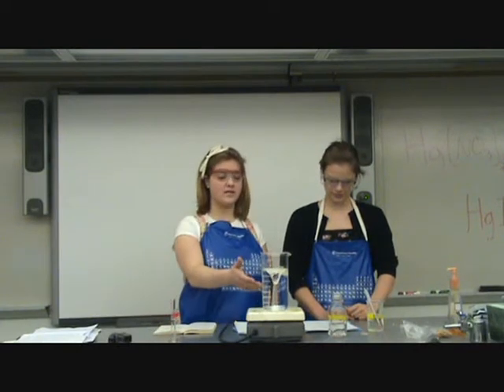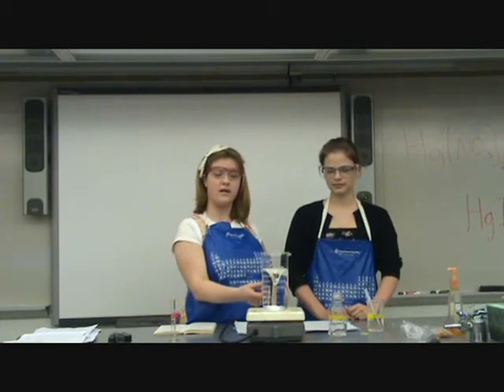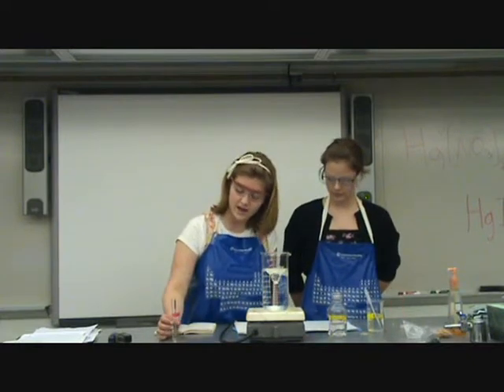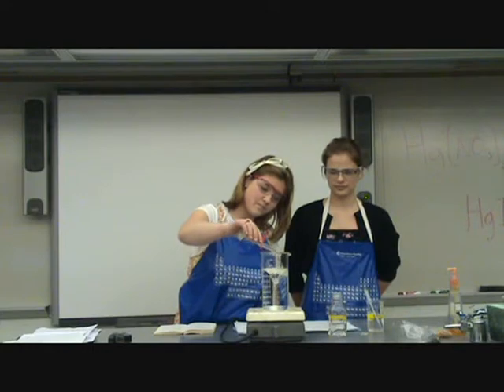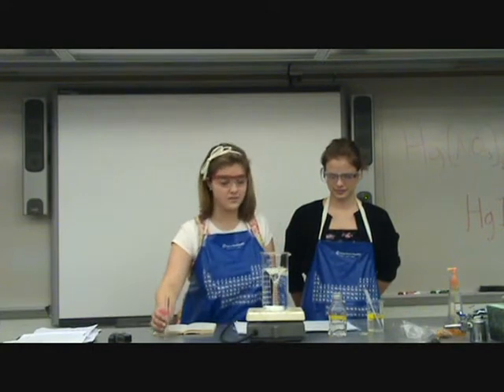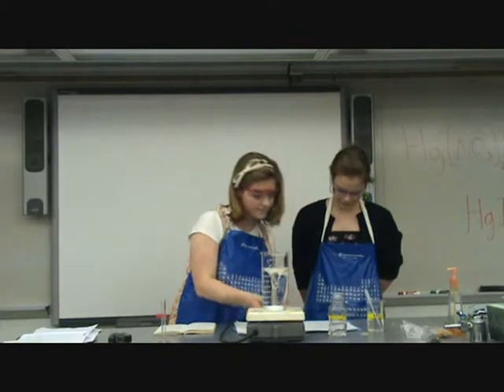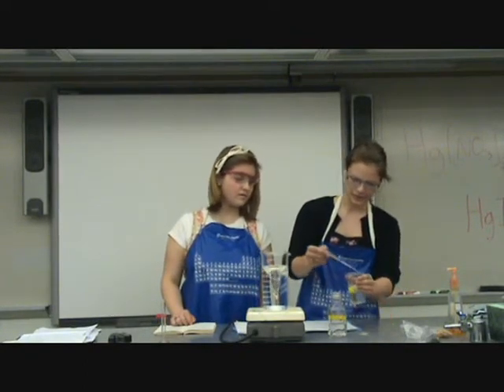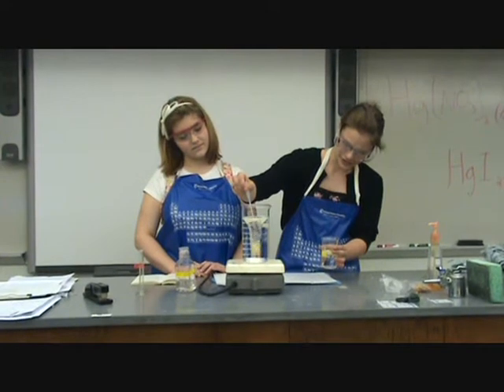So right now you can see that this is just distilled water, and there's a vortex which is being created by a magnetic stirring rod in the bottom. And I'm going to go ahead and add some mercury 2 nitrate to the center. And we're just going to let it disperse throughout. And I'm going to turn up the vortex a little bit. Now I'm just going to add a few drops, as long as we'd like. Now that's the nice orange color we're going for.